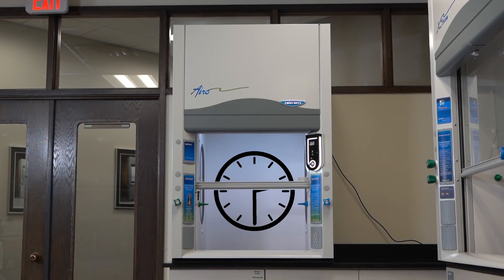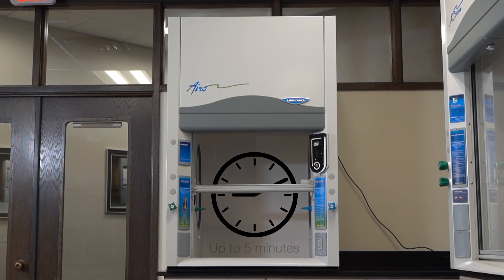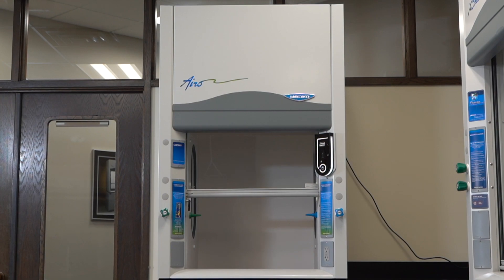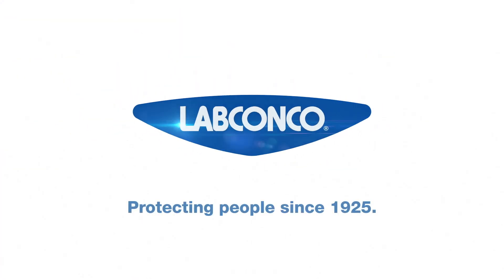Please note that the side panels must be installed for proper calibration. Calibration will take up to 5 minutes, and the command module will light up and chime several times. Your filtered fume hood is now ready to work.